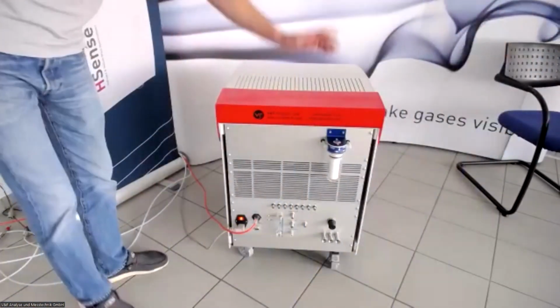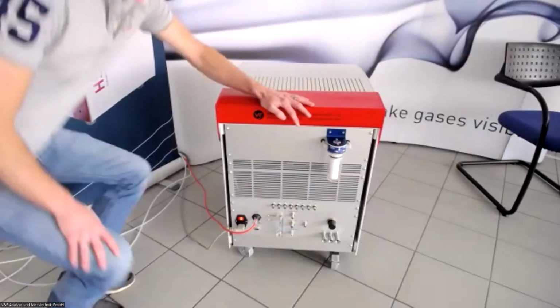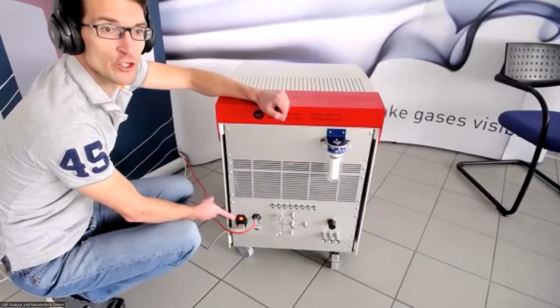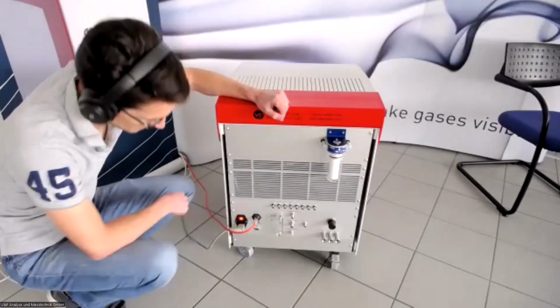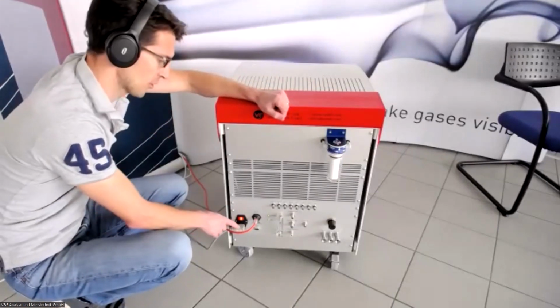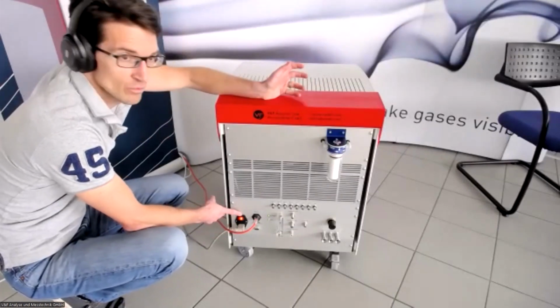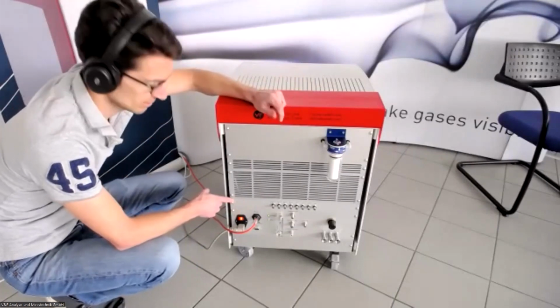So in order to operate the instrument, what do we need? We see here, we have a power connection and power switch. In this case, it's a 220 volt, 50 hertz power supply. And the main power switch will be flipped in order for the instrument to start.